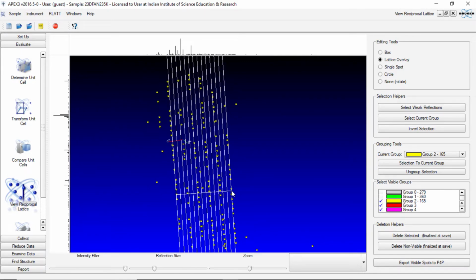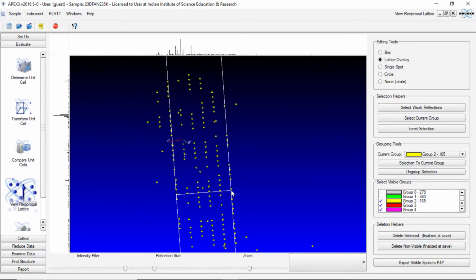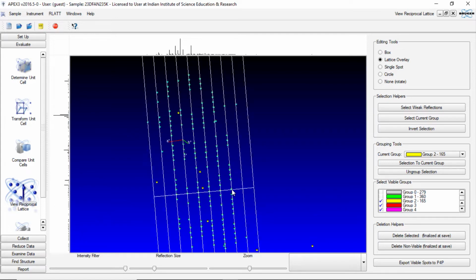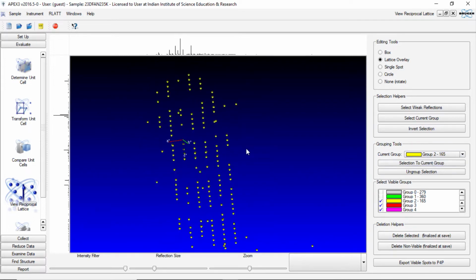So again, to reduce the number of parts, we should press minus, take the two ends and then press plus till it matches the lines. Then you go page up and include the reflections on either side and do an invert selection. Sorry, I made a mistake.